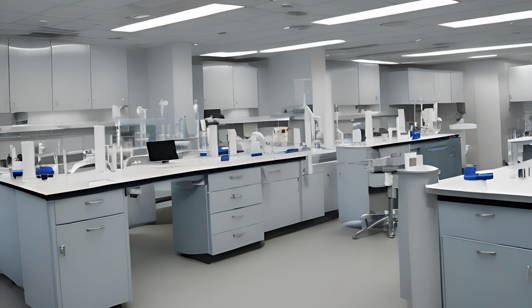In addition to that, you'll need to plan for relevant safety areas of concern, including but not limited to effective waste management, because some of the byproducts of the laboratory work that we do are, I'm not going to say toxic waste, but are not the kind of stuff that you can just dump down the sink. There are specific ways they have to be packaged and distributed out to the waste management section in the hospital.